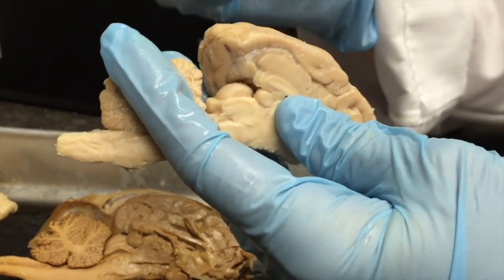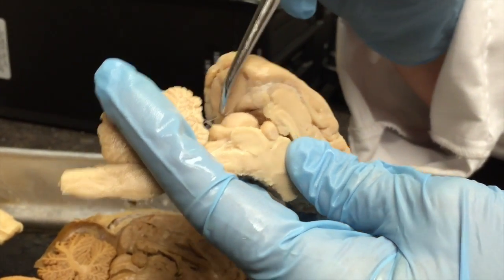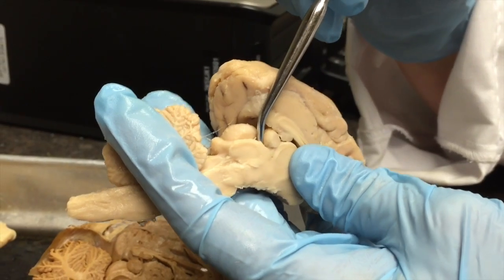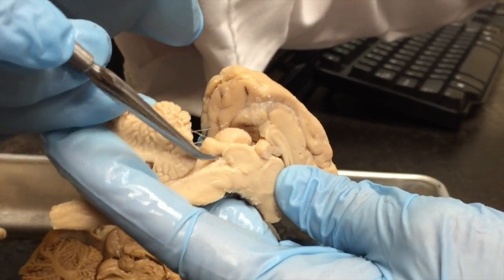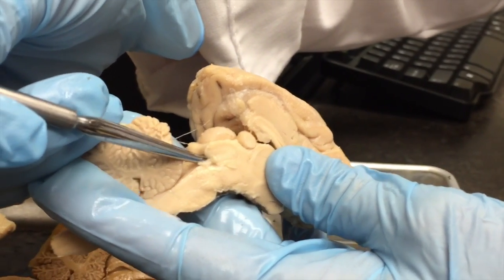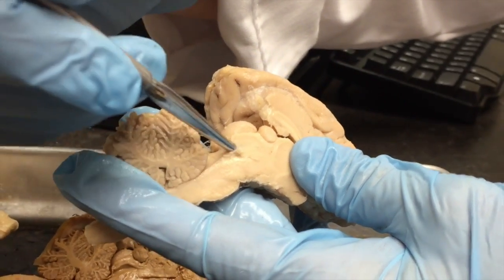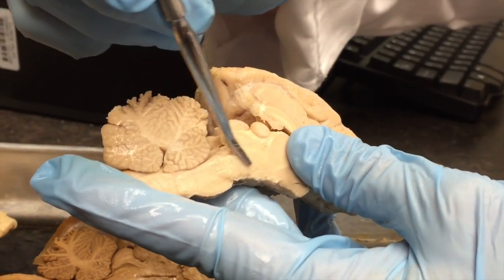All right, so I'm going to kind of peel this back just a little bit. We've got our superior colliculus and our inferior colliculus, but they did not cut this right along the mid-sagittal plane, so we can't really see very well our cerebral aqueduct. My probe is in the cerebral aqueduct right now, and the cerebral aqueduct cuts through the midbrain, dividing it into the colliculi and the cerebral peduncles, which would be here.